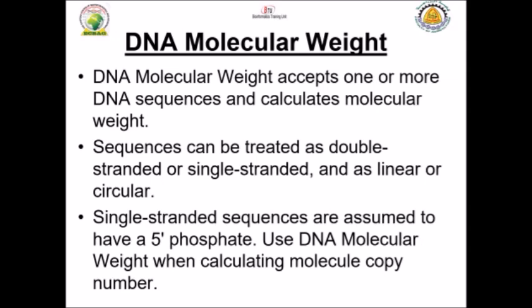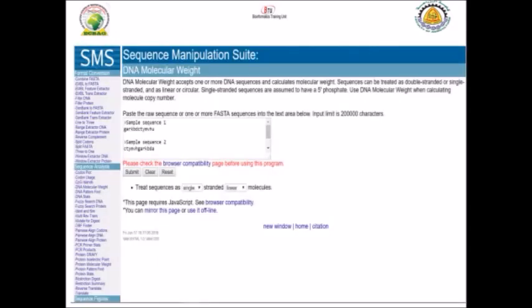It will calculate the molecular weight of that too. We can use this program when calculating molecular copy number, so it's very useful for molecular biologists depending on their kind of research. The interface is very easy to use.